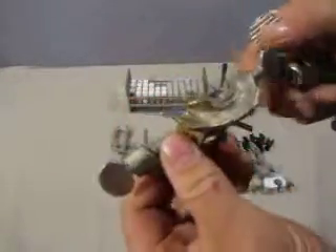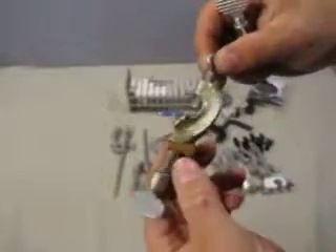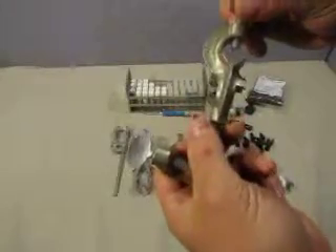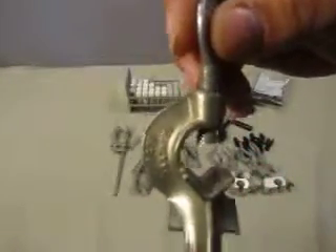It's a double clamp — pretty neat. On it it says Castology 1451. We've got two of those made by Fisher also. Looks like everything is probably Fisher here.